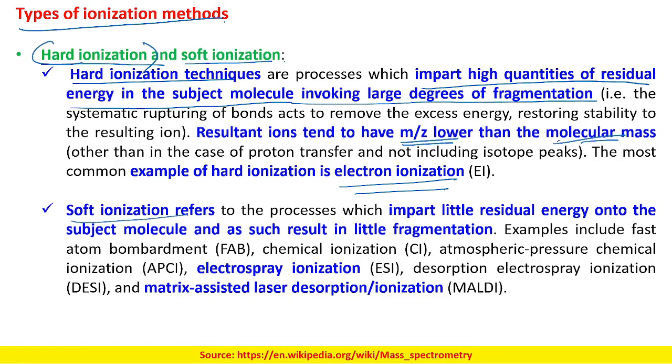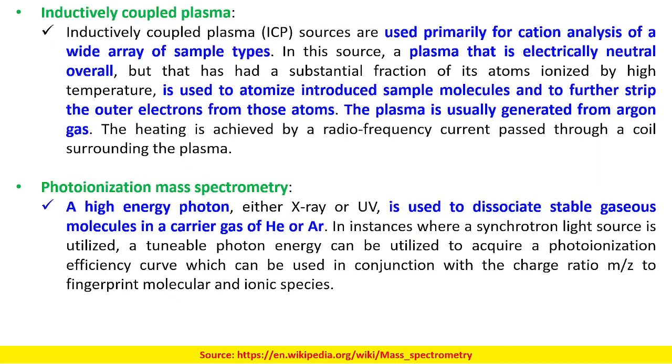Then we have soft ionization, which imparts less energy onto the subject molecule, and as a result we have little fragmentation. So over here we have different types of ionization techniques. However, we will only be discussing electrospray ionization and MALDI ionization, because these two are most commonly used in biological analysis.